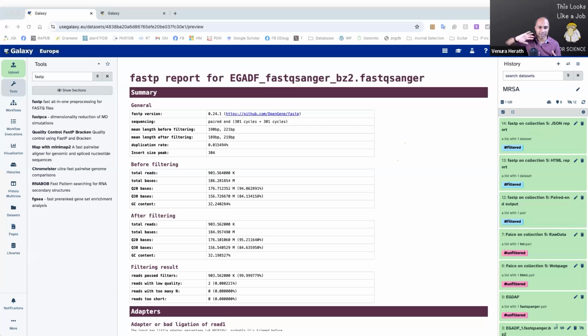You will see the results in a bit. It's what we call a compact hash table, in technical terms a probabilistic data structure, and that helps us do queries very fast. Otherwise, it will take some time.